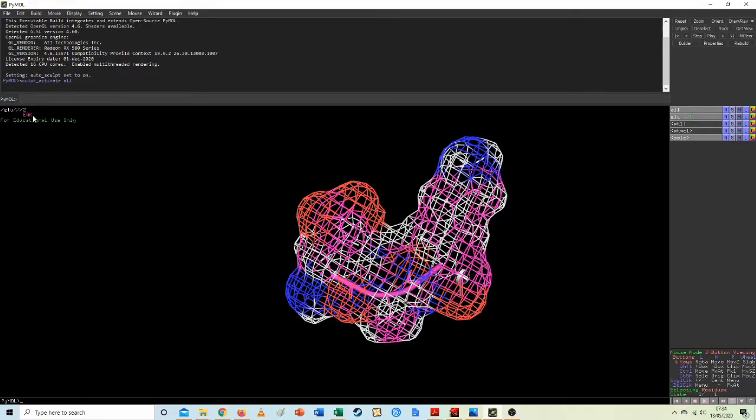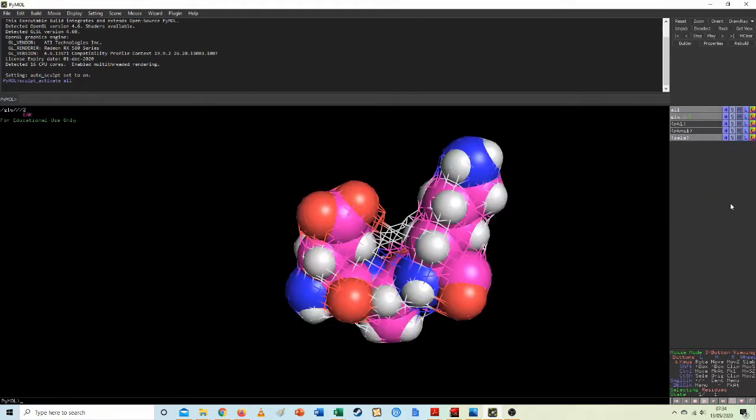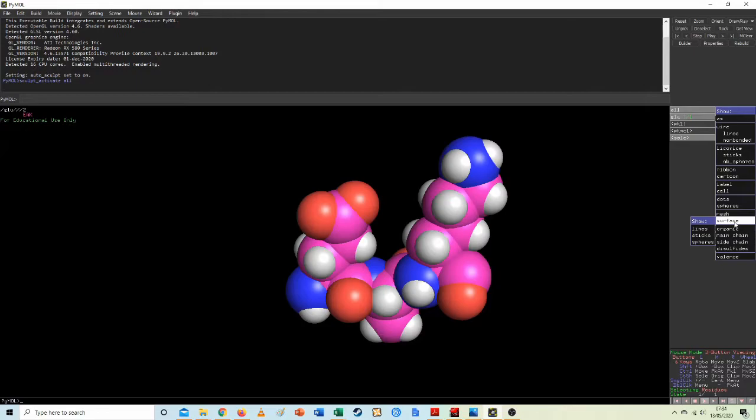and we've got our 3 amino acids all linked together, and that's what we've got. And we can play about with it. We can show it as spheres and meshes and dots. We can also hide those things. So if I want to hide that mesh, oh, can I show? Oh, that's a shame.